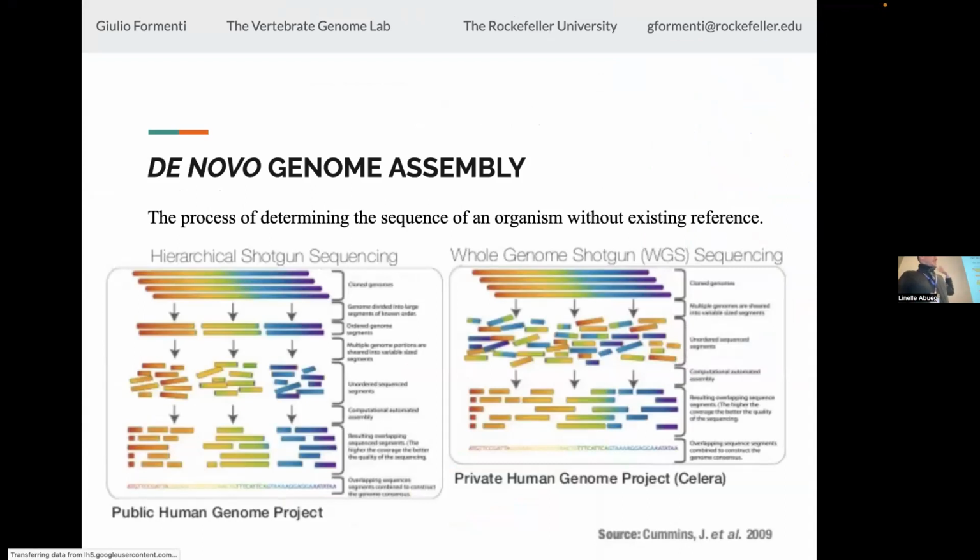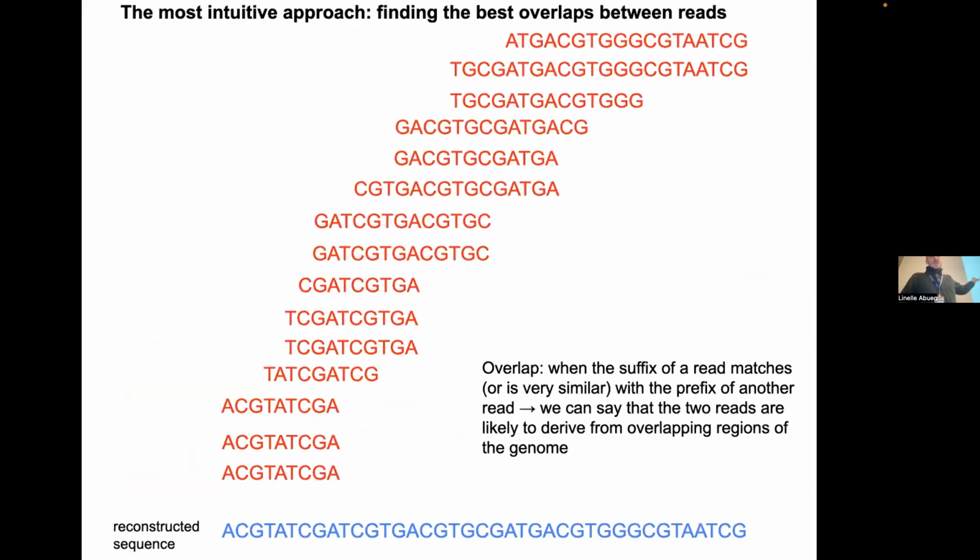Remember this slide from my first presentation? We had these two approaches to completion of the human genome: hierarchical shotgun sequencing, which we don't use anymore because it has these BAC and YAC intermediates, and whole genome shotgun sequencing, which is really what we do. But of course, that's more challenging from an algorithmic perspective because there are way more overlaps that you have to compute.